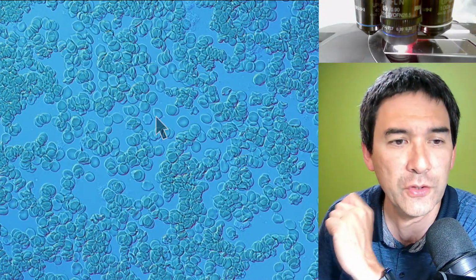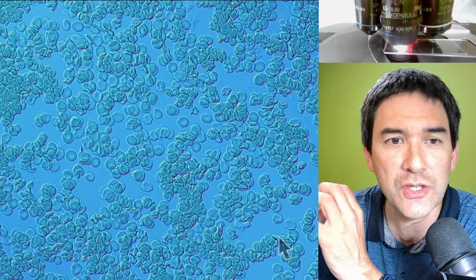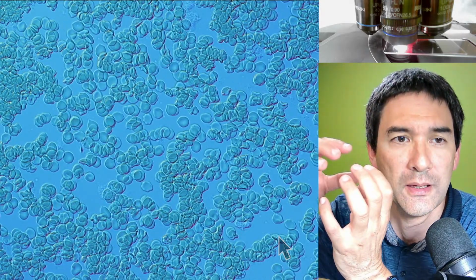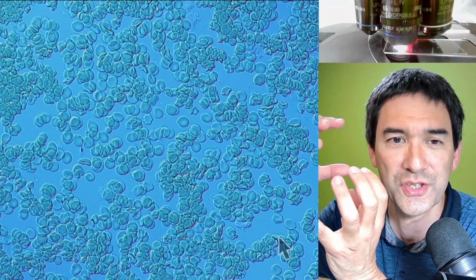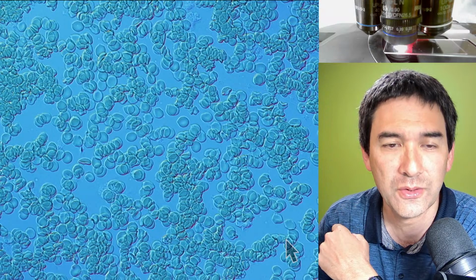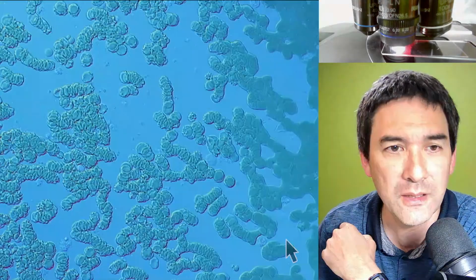And then if you're very patient, and the blood starts to dry out, and sometimes you see this on the edges happening first, then you might also see that the blood cells start to develop spikes. This is because the cell shrinks as it loses water. So this is also something that is sometimes visible, okay?